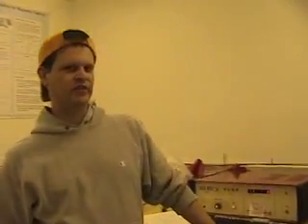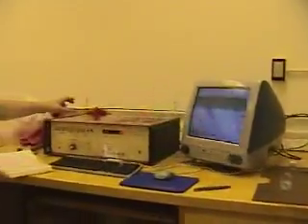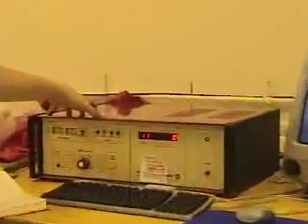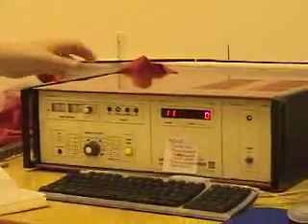Hi, my name is Curt, and today I'm going to show you how to use the Kappabridge for doing anisotropy of magnetic susceptibility. Here we have the Kappabridge, and it comes in three parts: there's a computer that controls it, there is the main unit, and there is the sensor over here where we put the samples in.